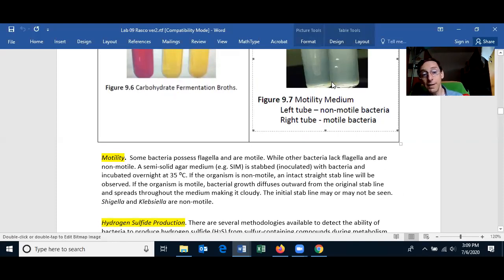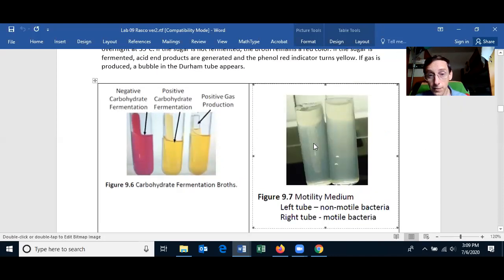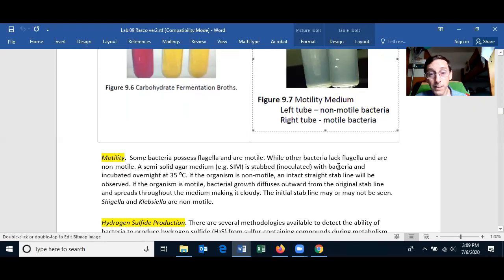And that's how I'll show you the motility test. Another way to see if a bacteria is motile is to put the bacteria in a live mount, meaning a slide in water or saline, and then put a cover slip and look at the bacteria under the microscope, and you can actually see the bacteria swimming around. Remember, bacteria, if they're motile, have a flagella.